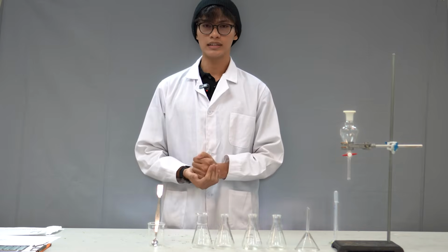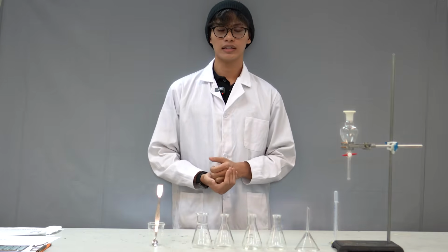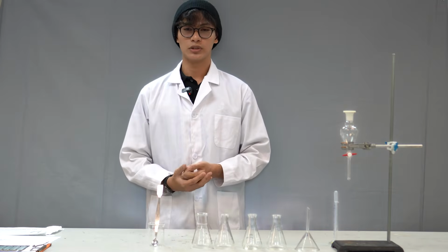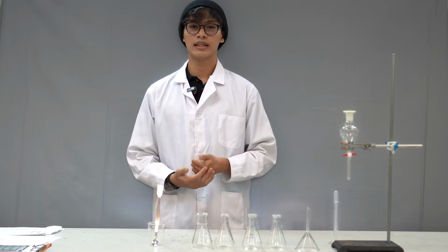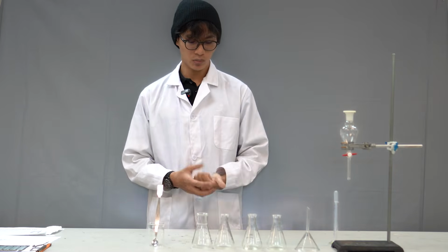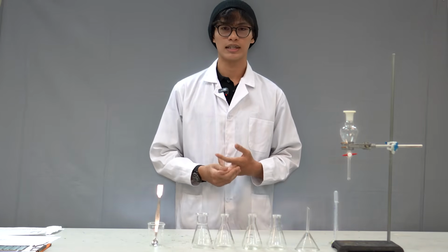So, the procedure is possible because of our hypothesis, which was based on the principle of solubility differences: an organic compound containing an acidic, a basic and a neutral component can be successfully separated by reacting the acidic component with an aqueous base and reacting the basic component with an aqueous acid.